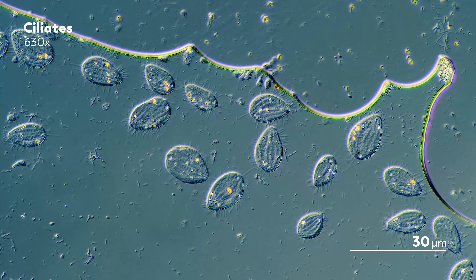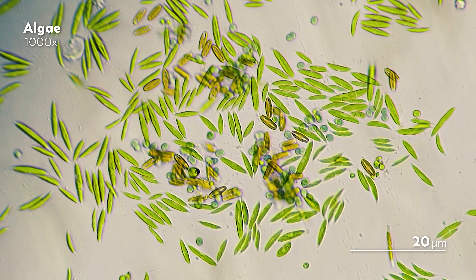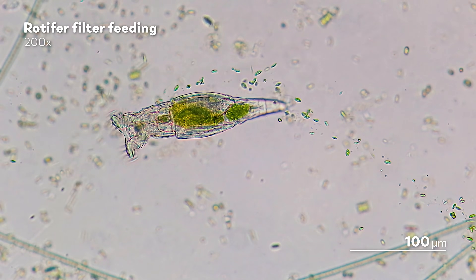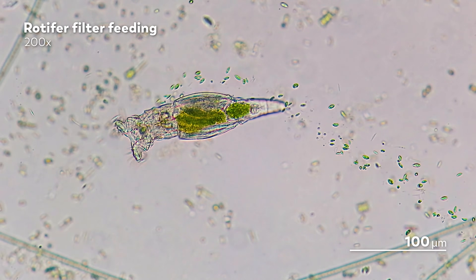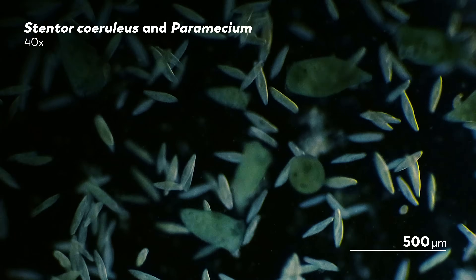Our own journey through the microcosmos has meant traveling through the lenses of a few different microscopes. And that's why, if you've ever seen our earlier videos, you know they look quite a bit different from what we see today. And that is part of the fun of microscopy. A rotifer under any lens is a thrilling encounter. It's just that the nature of the encounter shifts with the light that you shine on it. There are so many different ways to see the world.